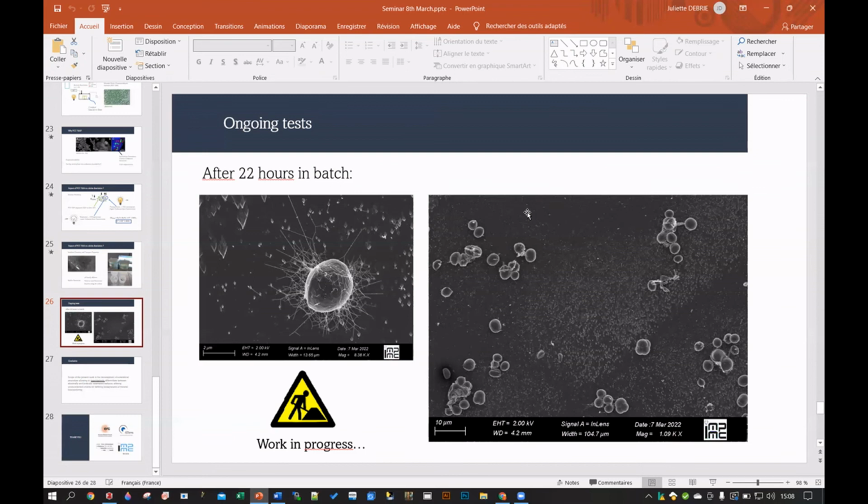Have you done that? I think I saw some work like this to fix bacteria, using organic material like PMMA, and you can spin coat it and then stick to that. I'm not trying with EPS. We could try, because there are some strains that produce a huge amount of EPS. I don't know if you can spin coat that on a calcite chip or maybe not, but that would be very interesting.